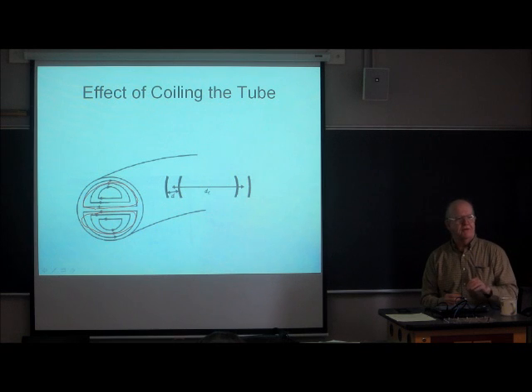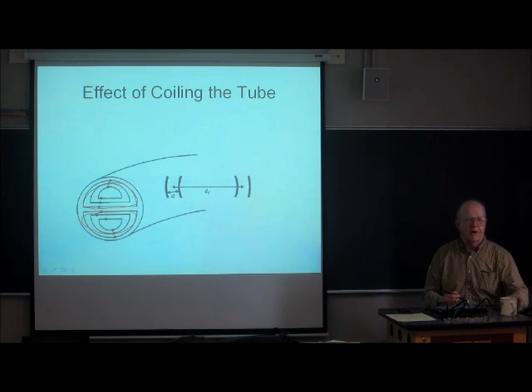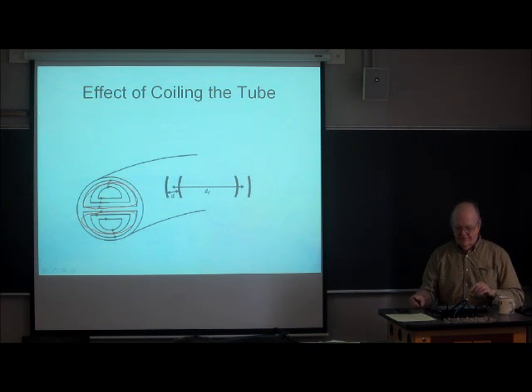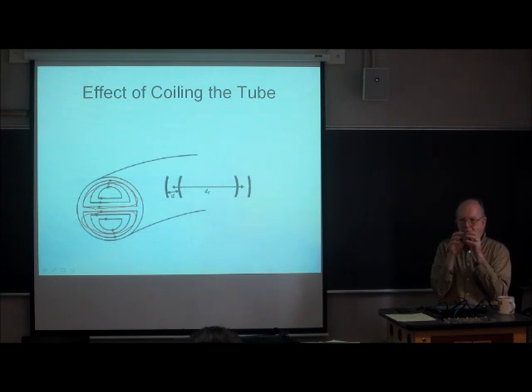And it turns out that these are good, because they effectively enhance radial mixing. And if they enhance radial mixing, they're going to oppose the broadening caused by the Poiseuille flow. But in order to get much help from this, the radius of the curvature has to be real small.